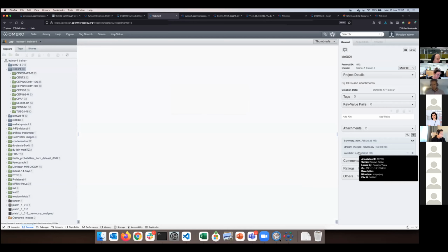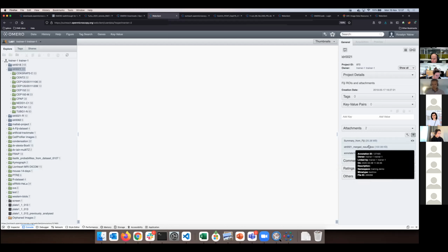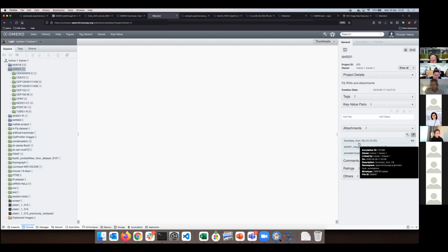The important thing to remember is, if it's not an Omero Table, Omero will do nothing with that attachment in this view, except when it's CSV and PDF, which are indexed by the searcher. So if I have some term inside a PDF or text file, I can search it via the search here. I can attach a MATLAB file or whatever, but don't expect that to be executed by Omero.